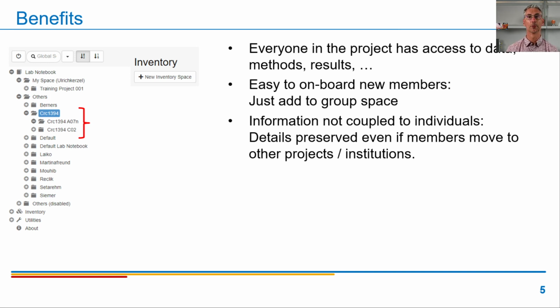It also helps us from an organizational perspective, because the information is no longer coupled to individuals but to projects. That means that all the details are preserved, even if, for example, some of you move on to a permanent position elsewhere.